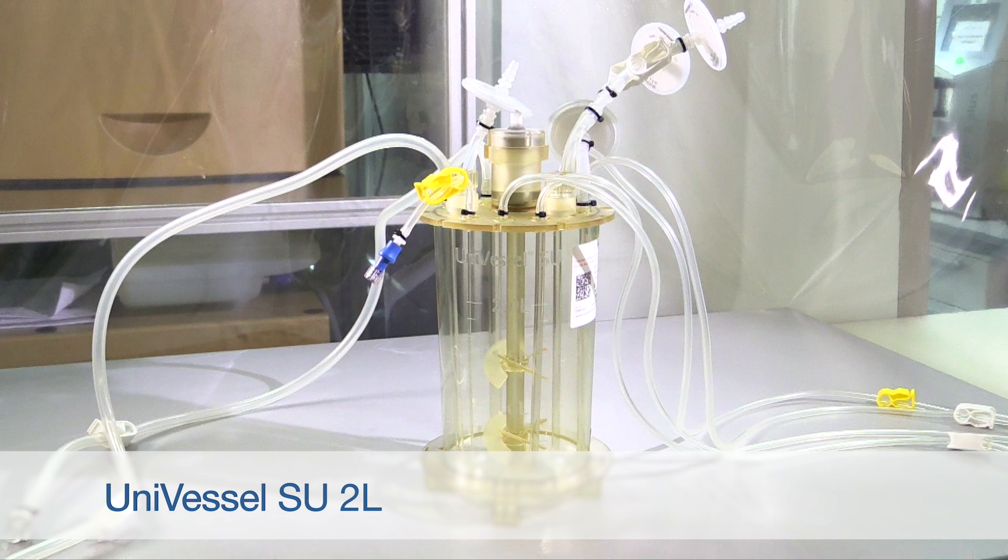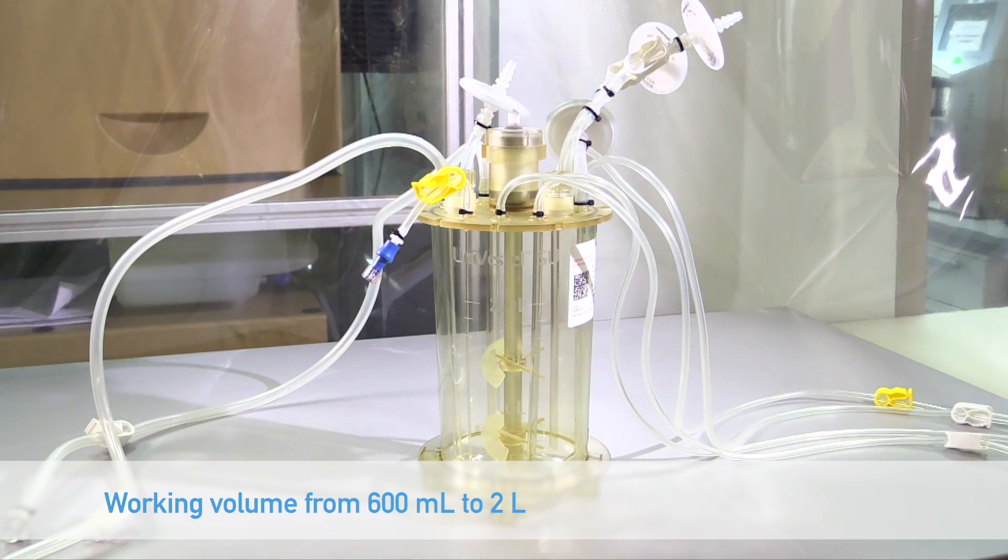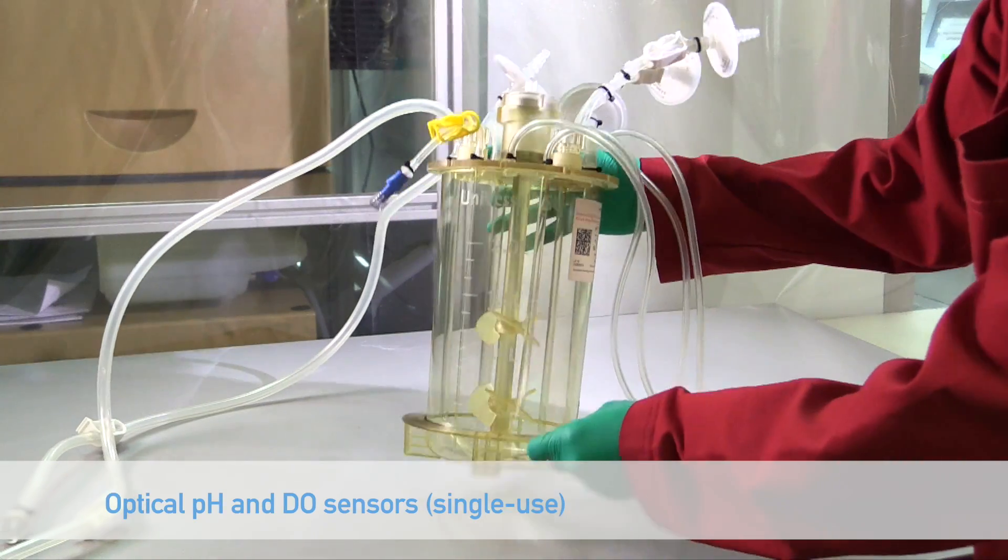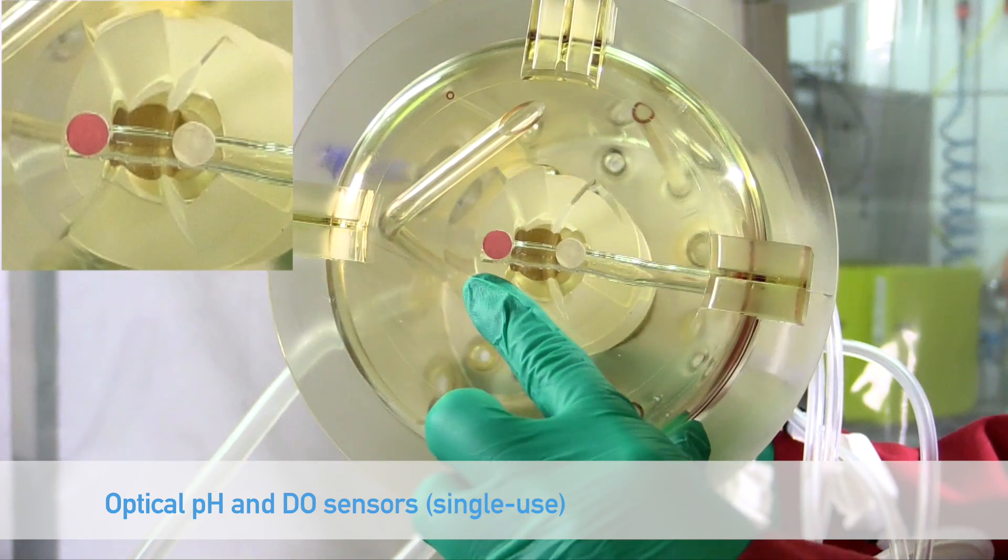The Universal SU is a gamma-sterilized rigid polycarbonate vessel with a working volume from 600 mls to 2 liters. It is equipped with two three-blade segment impellers and optical sensors for non-invasive pH and dissolved oxygen measurement.